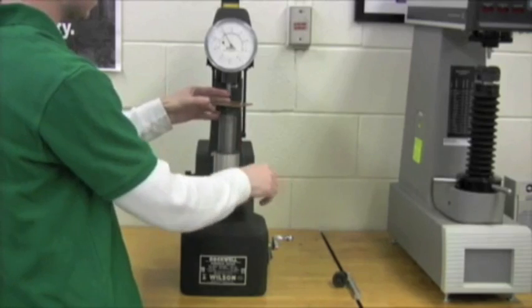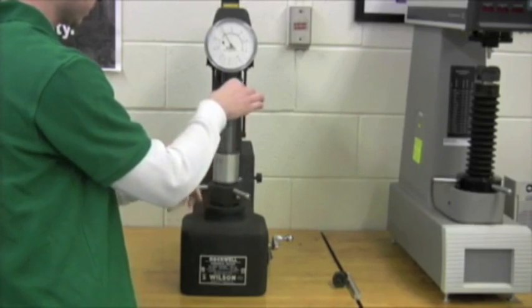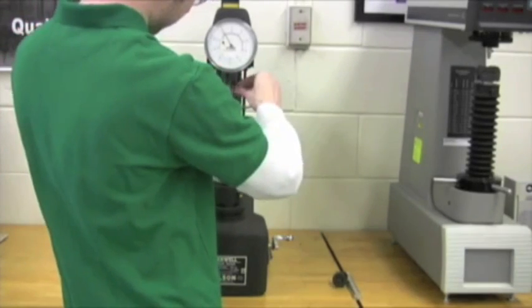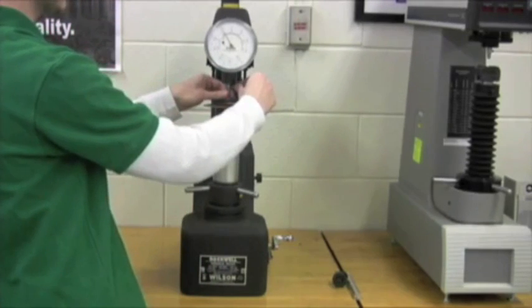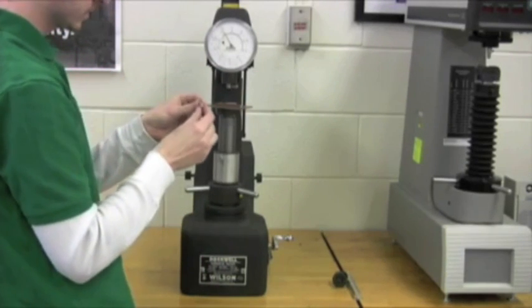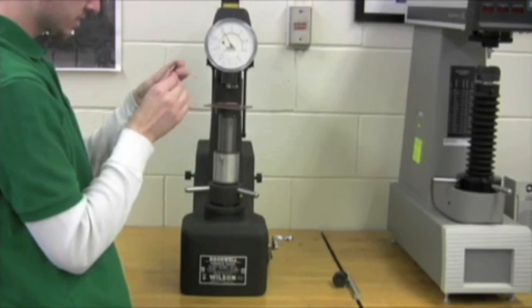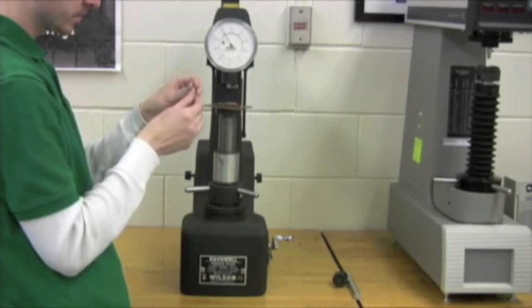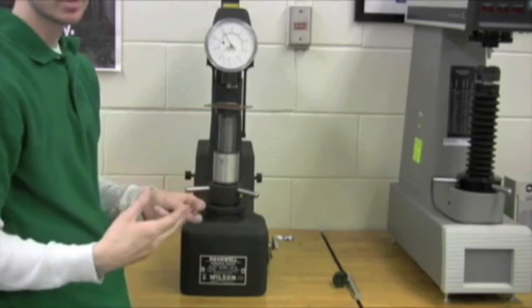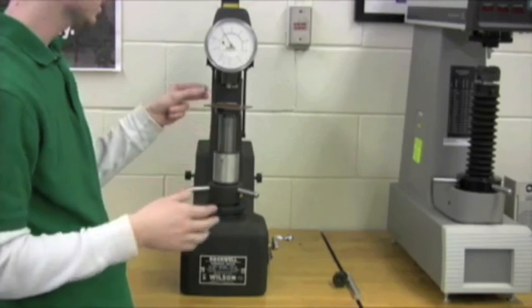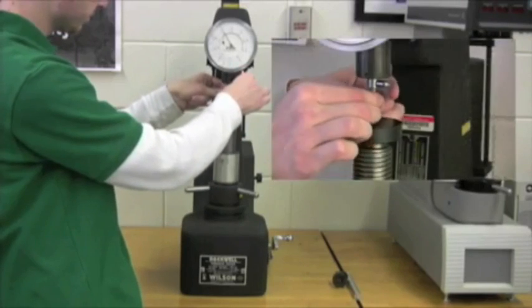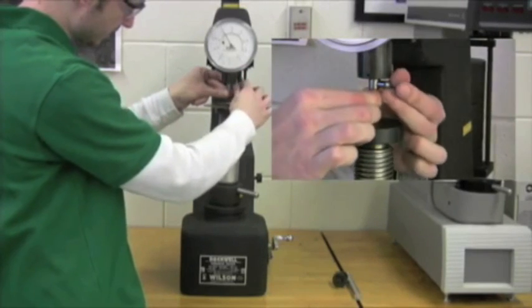I also want to talk about our penetrator. Penetrator is what is actually indenting the piece of material. This is our C penetrator, C Brale. And there's a couple different other ones for the type of material that you're going to need. But for this, we're going to be using the C Brale. And we just go to tighten it up.